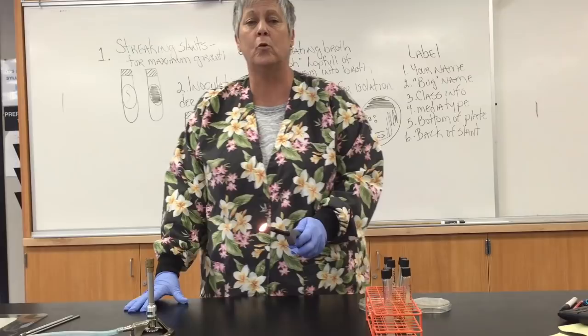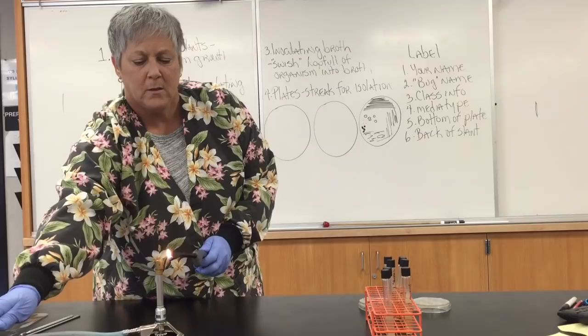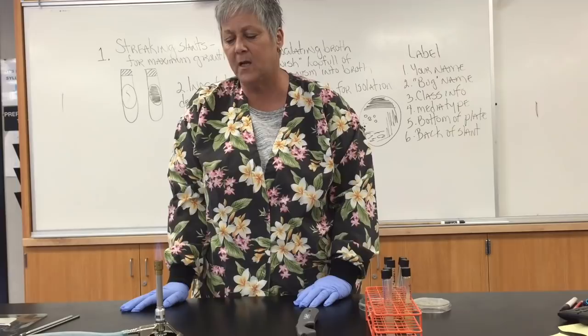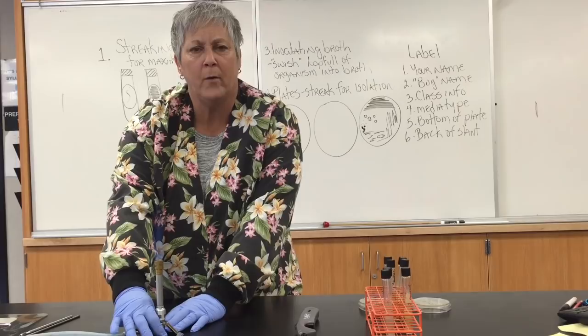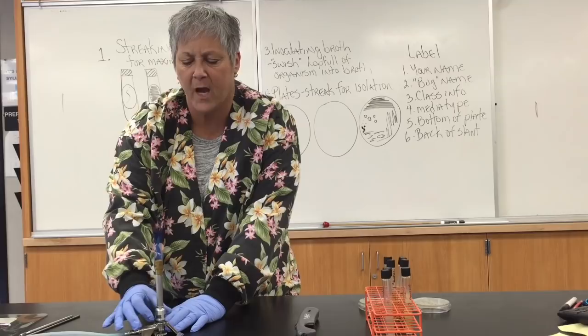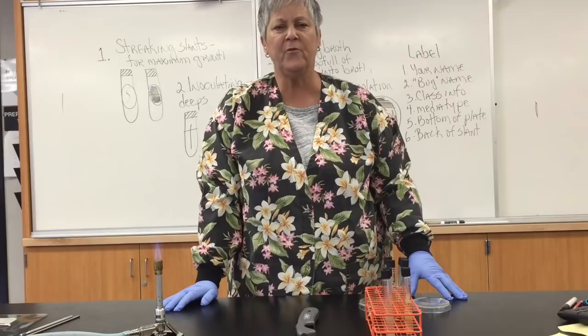First let me demonstrate how to light a Bunsen burner. The most important thing is to remember to light your lighter or match before you turn the gas on. Hold it just over to the side of the burner, not directly over where the gas is going to come out. Slowly turn the gas on. I've got a nice blue cone in the flame, and that's exactly how I want it. You can adjust the height by rotating the dial on the bottom — a higher flame for boiling water, but for aseptic technique we want a flame about this height. Rotating the barrel left or right adjusts the mixture of gas and air.